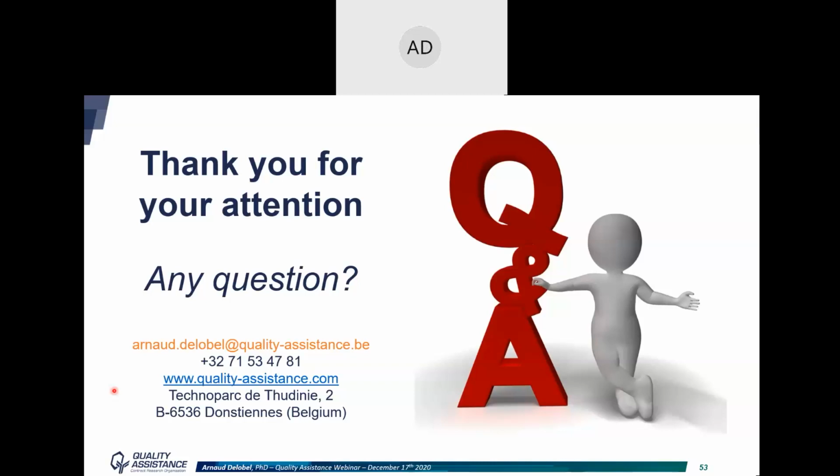So in that case, you would probably have to optimize a salt gradient method or try to optimize your pH gradient method. But in our hands, we were not able to optimize very significantly the resolution by tweaking a little bit the gradient of the pH separation. So for a stability testing method, I would say either the icIEF method or a salt gradient product-specific ion exchange chromatography method.